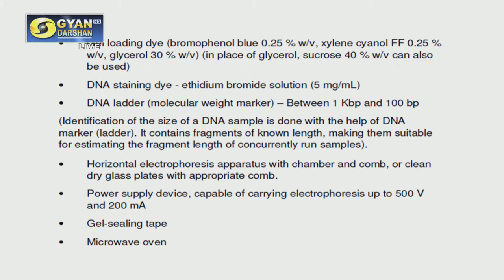So just comparison. Comparison with a ladder means comparison with a series of fragments whose molecular weights are known and which you have loaded in the agarose gel.